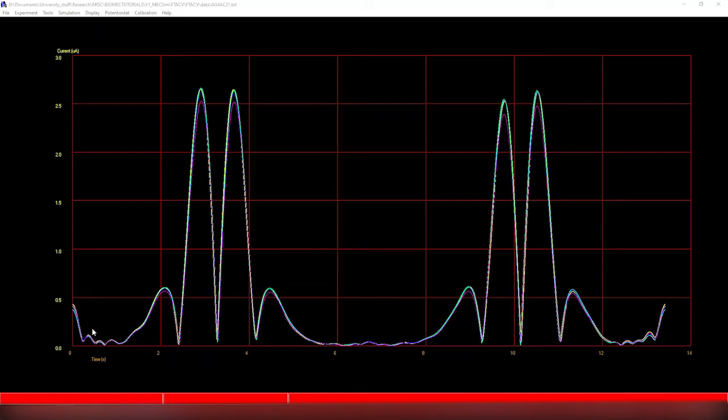In BIOMEC, we have one other function at the moment that we can use to extract the harmonic information in a better way, to extract the Faradaic component and current component and remove the noise that is a result of the windowing function.